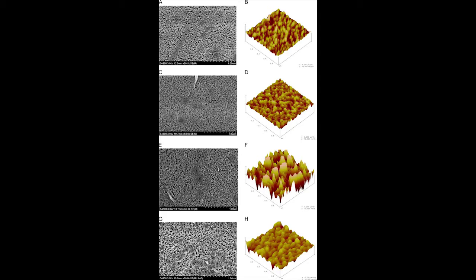In principle, AFM can provide higher resolution than SEM. It has been shown to give true atomic resolution in ultra-high vacuum, UHV, and more recently, in liquid environments. High-resolution AFM is comparable in resolution to scanning tunneling microscopy and transmission electron microscopy.